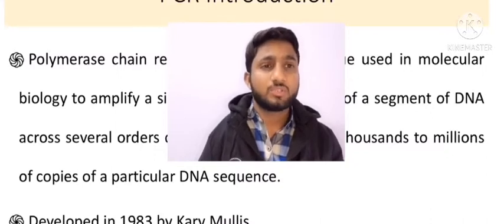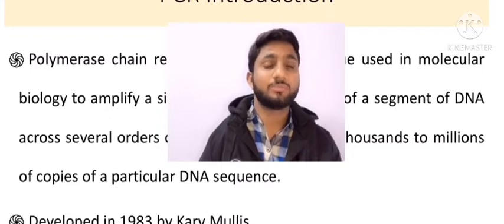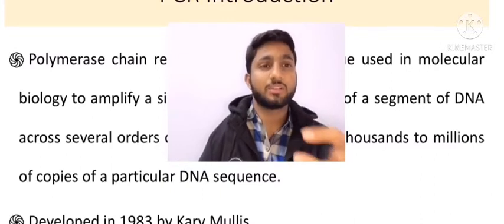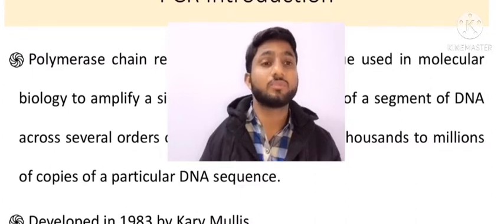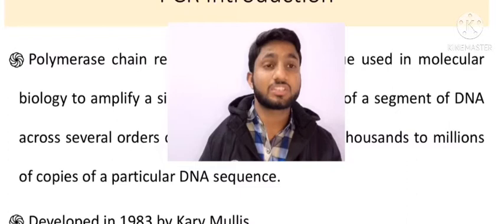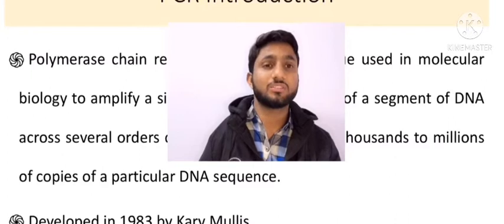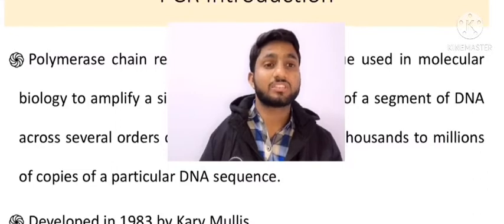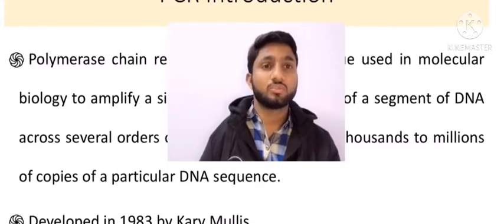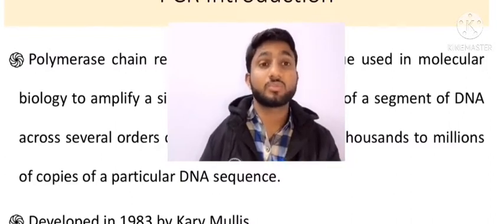So in the next step we usually want to go for amplification. In the amplification process we want to amplify a specific segment of the DNA. Why are we going to amplify a specific segment of a DNA? We want to know about the function of a particular gene located on a DNA. That is not easy, because DNA is a very large molecule and we need to specifically highlight or amplify the specific segment or target segments which we want to study or observe.